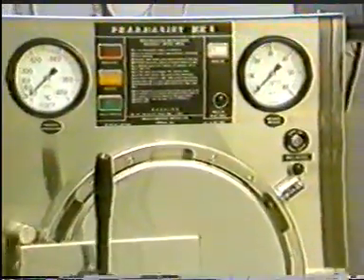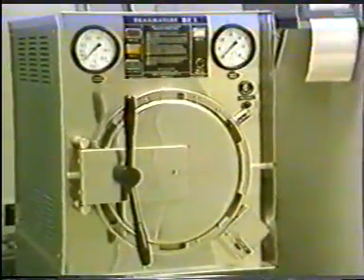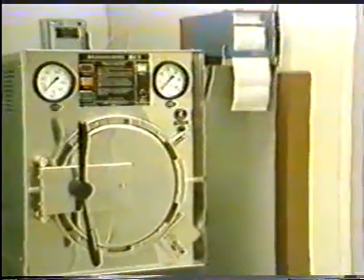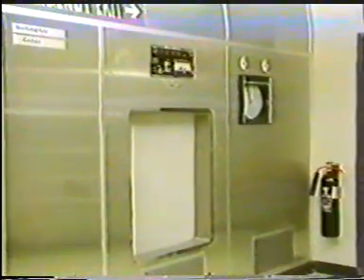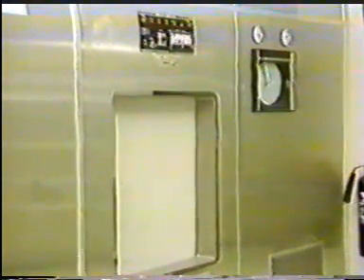Some products are terminally sterilized by heating. Usually an autoclave or a hot air sterilizer is used. Autoclaves range from small ones, suitable for eye drop bottles and ampules, to large ones like this, for bigger containers. Heat sterilizers are the subject of a document, HTM10, which governs their commissioning, maintenance, and use. The principles of sterilization are explained more fully in the program entitled Sterilization.